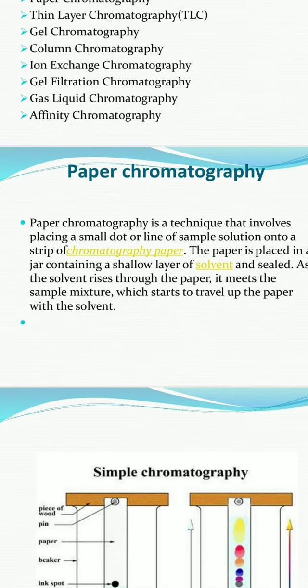So paper chromatography is a technique that comes under planar chromatography. This technique is defined as one in which the analysis of an unknown substance is carried out mainly by the flow of solvent on specially designed filter paper. In this chromatography, a cellulose paper or different Whatman papers are used as the stationary phase for the identification, separation and purification of mixtures of substances.